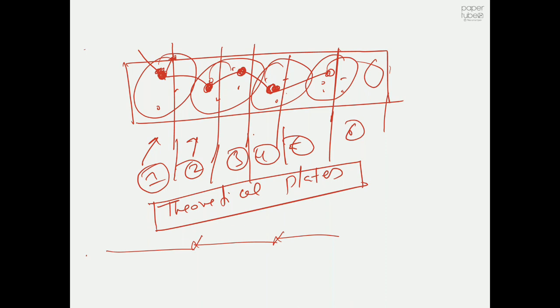And then I already talked about this: retention time is dictated by some physical process, which is nothing but mass transfer. And mass transfer is happening due to diffusion, and diffusion naturally occurs via a concentration gradient. Apart from that, if you look at it particle by particle, something is happening on the particle surface, where your analyte is getting adsorbed and establishes some equilibrium with analytes in the solution phase. So this is the pure adsorption concept.